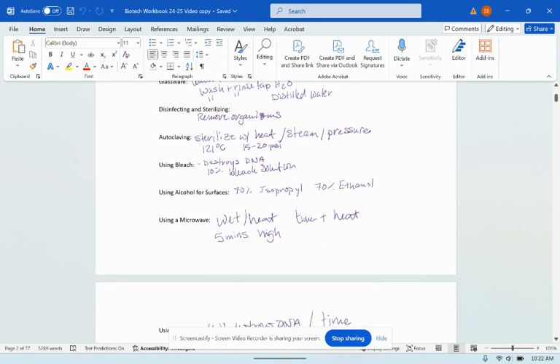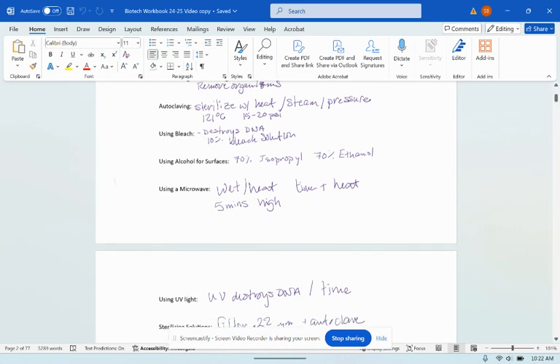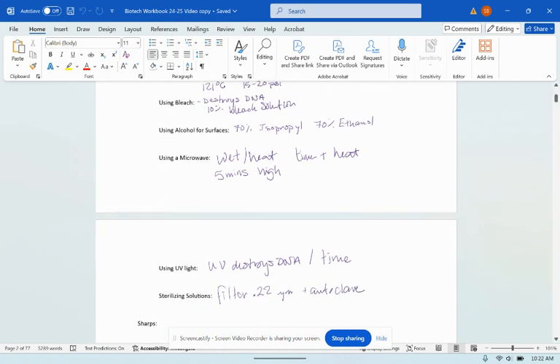A lot of times we will sterilize using the following techniques. We will use autoclaving, and that uses heat and steam and pressure to clean things. We use bleach, that destroys the DNA, and we use a 10% bleach solution. We will use alcohol for surfaces. We use 70% isopropyl or 70% ethanol, and that just denatures a lot of the proteins. It doesn't necessarily kill the organism, so it's not my favorite way to disinfect, but we will use it a lot.